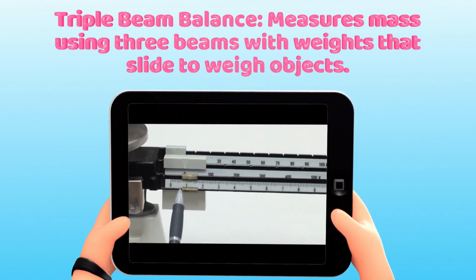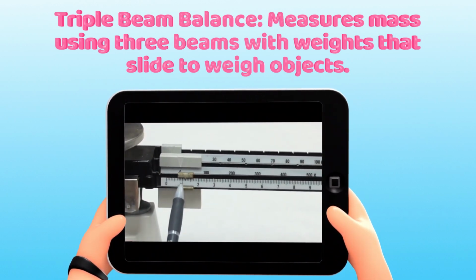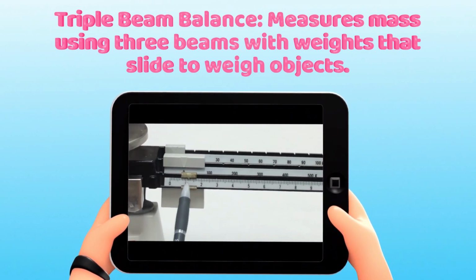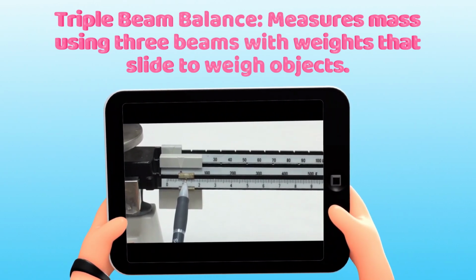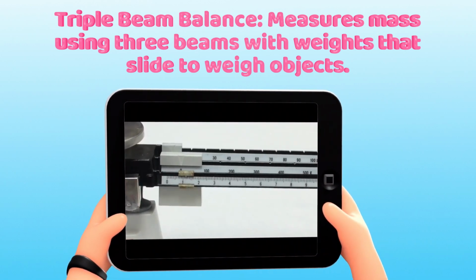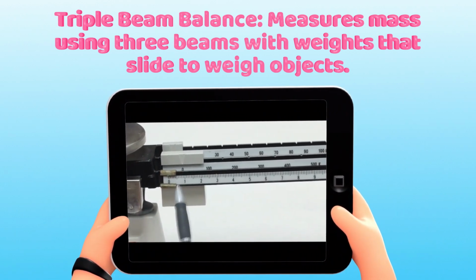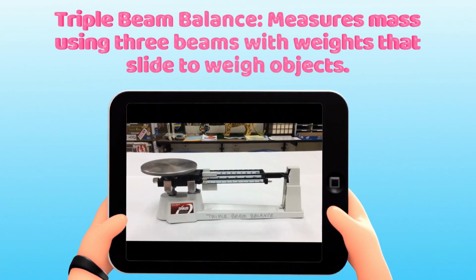So when we want to measure the weight or the mass of a substance, once you place an object, maybe a stone or any other object, on the plate for measuring, the readings will be taken first from the middle part.